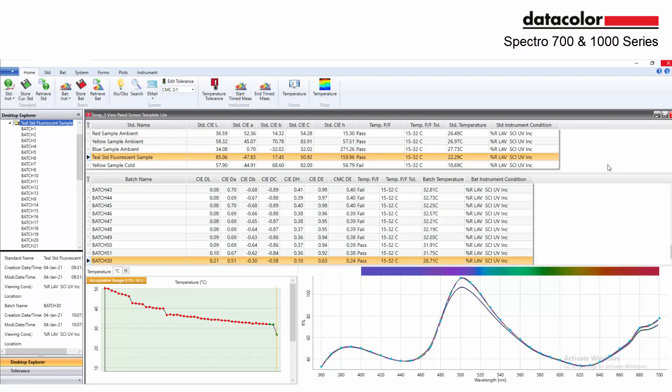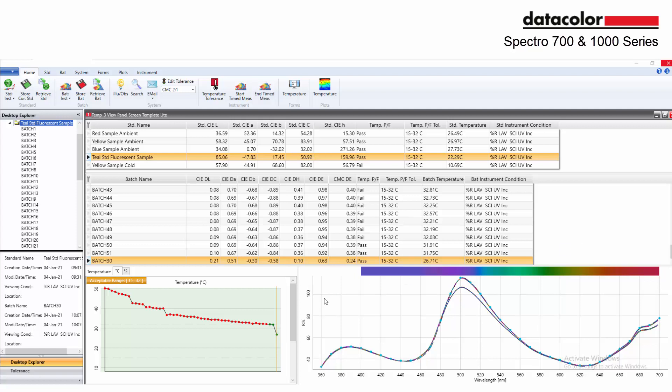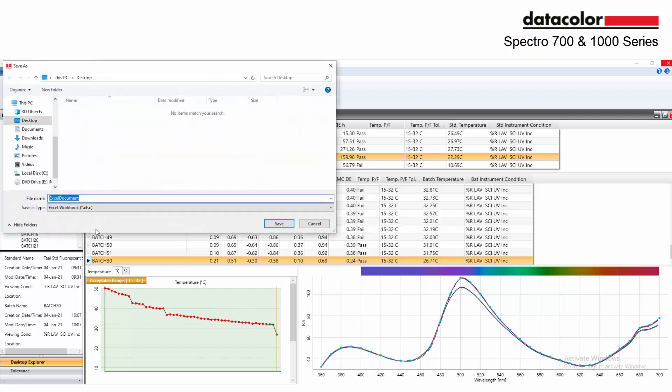The sample temperature captured during measurements can be exported into Excel along with the other columns within the grid. Right-click within the grid and select export all to export the temperature measurements for reporting.